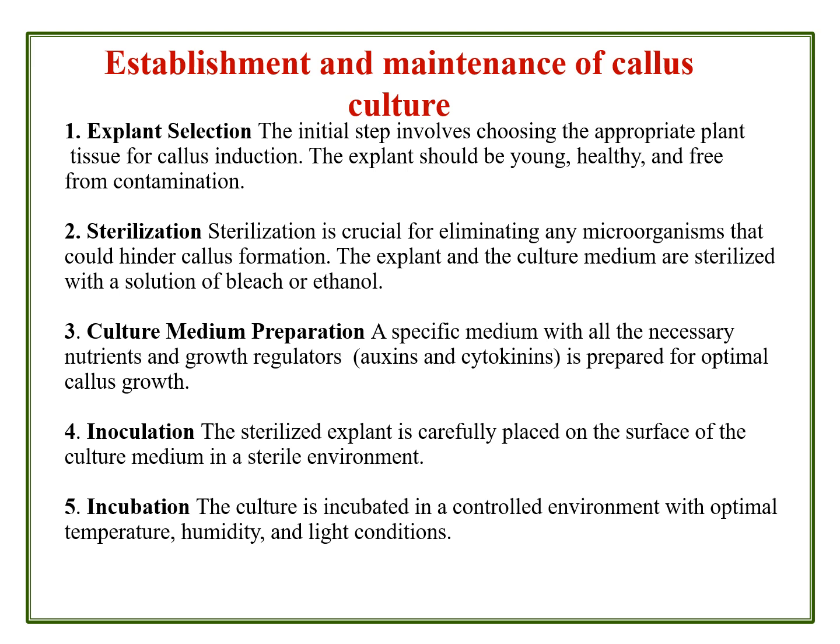Here, any chemical sterilants that adsorb on the surfaces of the culture material may be absorbed deep into the sections of the culture material and create more problems for callus culture establishment. So double distilled grade water is used to remove any trace of the chemical sterilants that adsorbed on the surfaces of the culture materials.